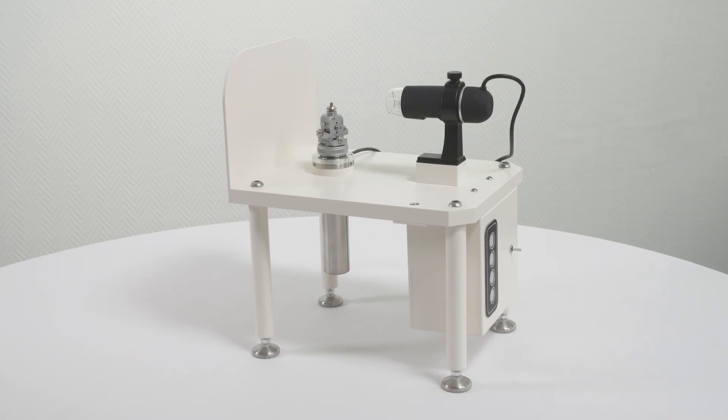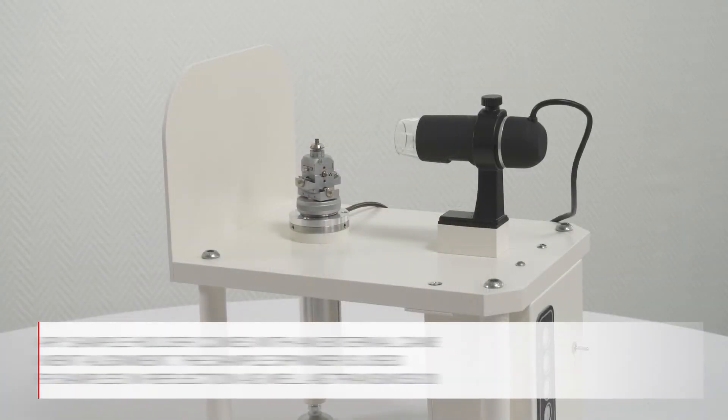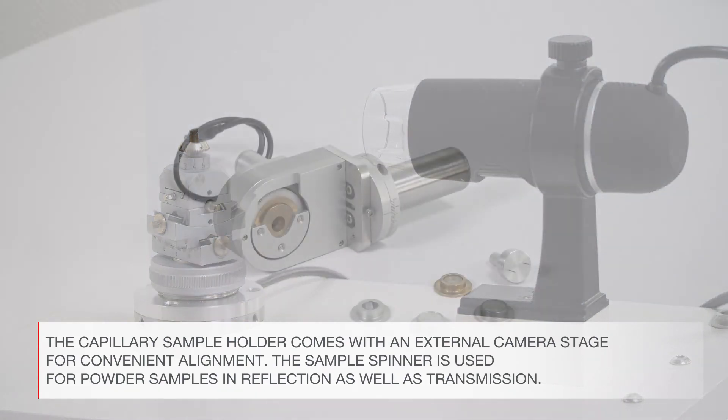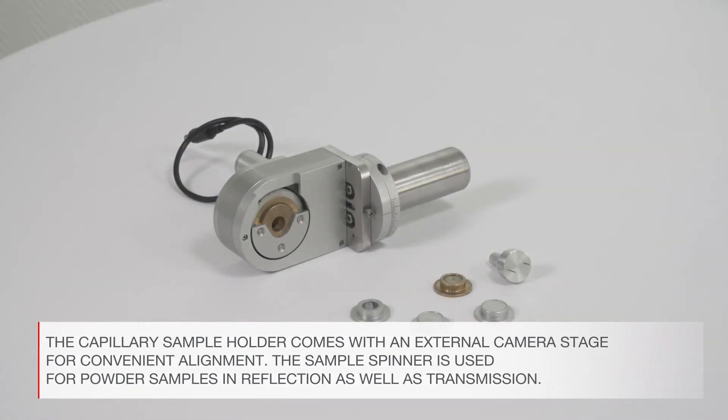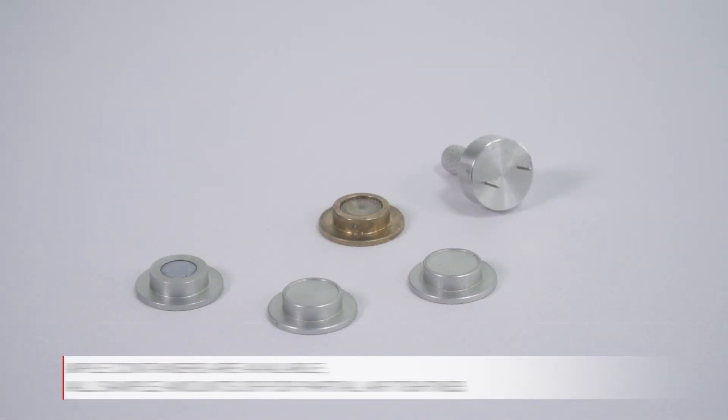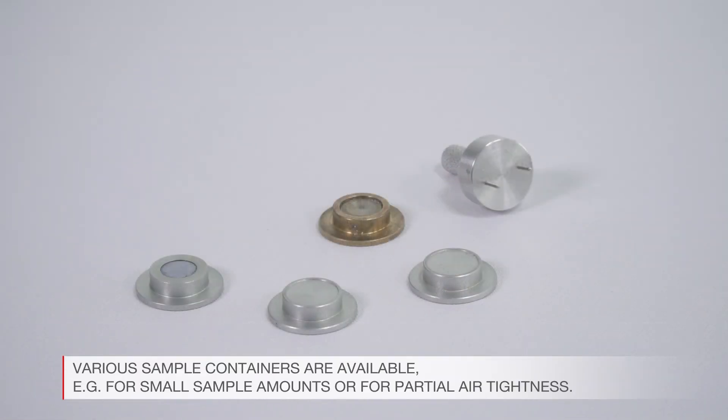The capillary sample holder comes with an external camera stage for convenient alignment. The sample spinner is used for powder samples in reflection as well as transmission. Various sample containers are available, for example for small sample amounts or for partial air tightness.